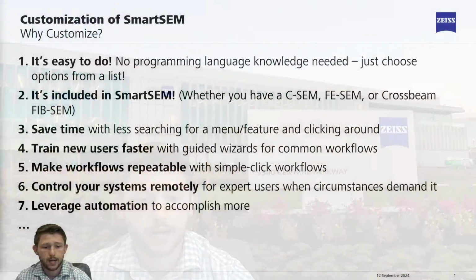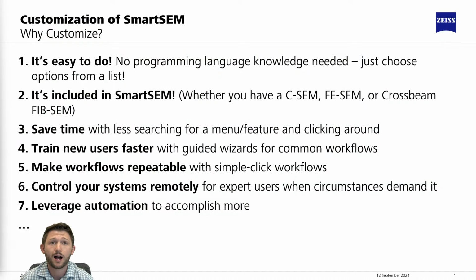So I'd like to start by covering why customize your SmartSEM interface. Well, I think first and foremost, it's really easy to do. It doesn't require any sort of programming knowledge. If you don't know Python, that's not a problem, or Java. You're really just choosing options from a list to perform this customization. The list is pretty comprehensive, as we'll see.